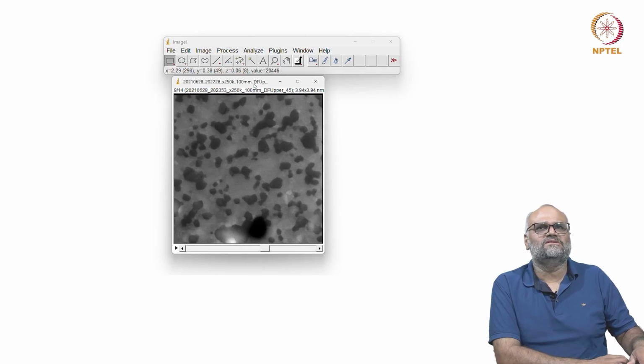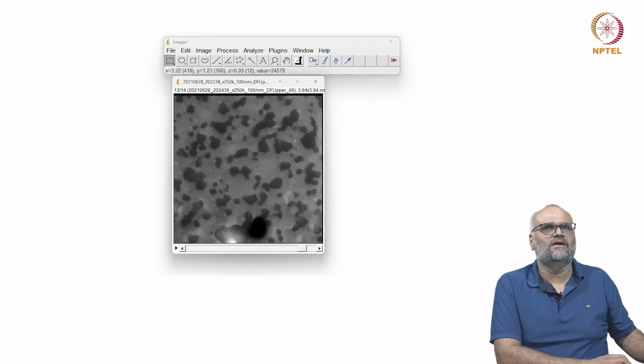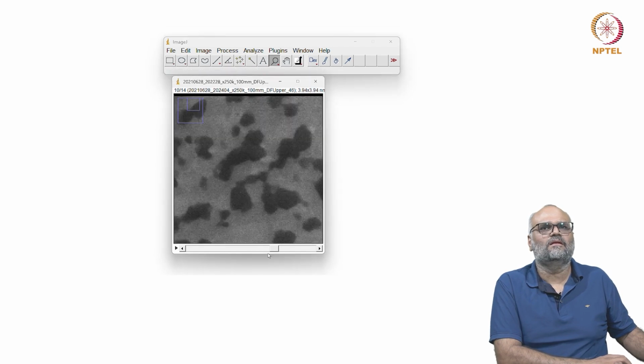If you look closer on the top, in this particular image here, there is a little black band that starts appearing, which indicates there has been some correction here.